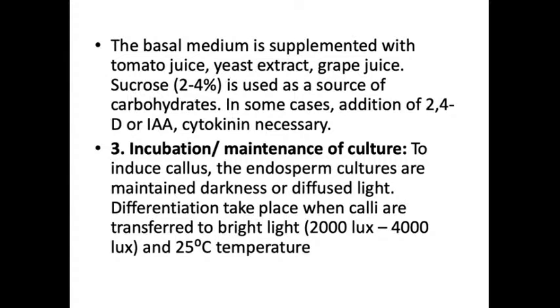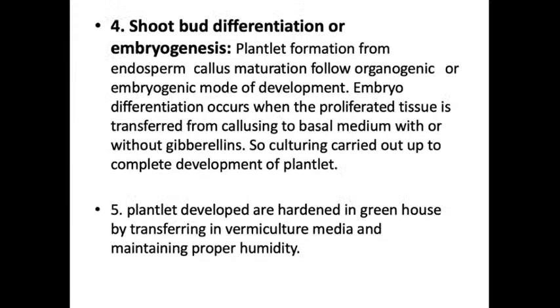Then incubation and maintenance of culture. To induce the callus, the endosperm cultures are maintained in the dark without light, and differentiation of your calli takes place on transfer to bright light of around 2000 to 4000 lux units and at 25 degrees Celsius. So you need this much light and then you need a 25 degrees Celsius temperature.